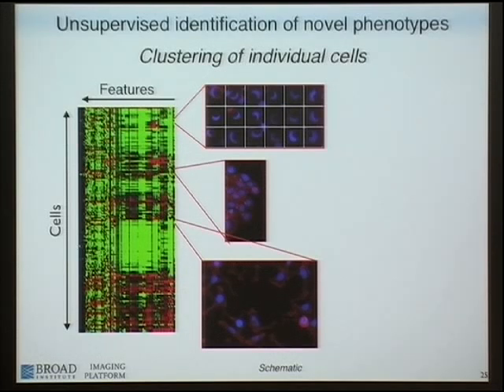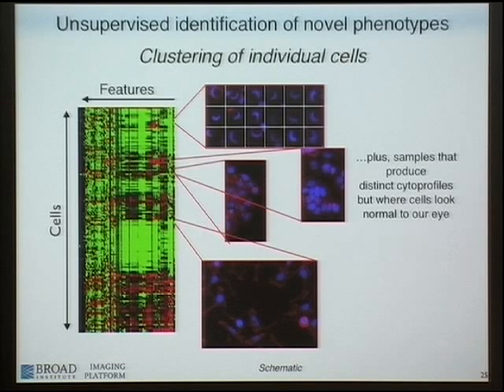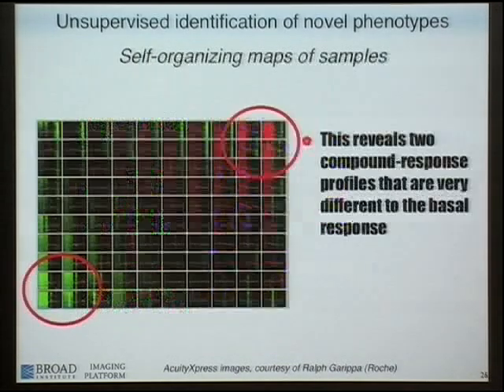Historically this is done by a biologist just flipping through images and making sure there isn't anything interesting and unusual. But the ability to do this computationally is really helpful. And so you'll hear a talk about that later in the session. In particular, what I find most fascinating is the idea that we can allow the algorithms to tell us that there's a particular type of cell that is unique and is measurably different from the others, but that difference may not be visible to our own eye. So it's visible in the sense that it's captured in an image, but not necessarily visible to the human eye. There are certainly many properties of cells that the computer can capture that we just are not tuned to look for. And so I think that's a very exciting aspect of using algorithms to extract features.